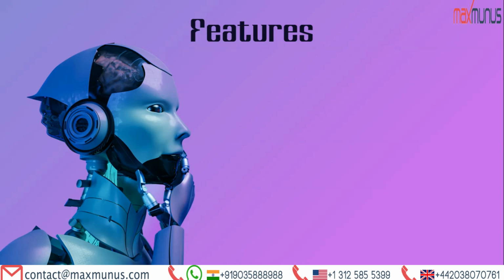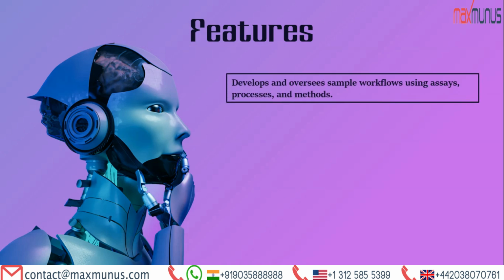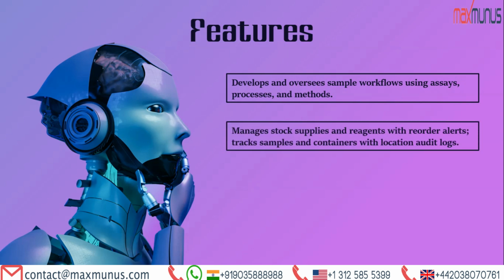Now, we have the basic features of Labware LIMS. And the features are: develops and oversees sample workflows using assays, processes and methods. Manages stock supplies and reagents with reorder alerts, tracks samples and containers with location audit logs.